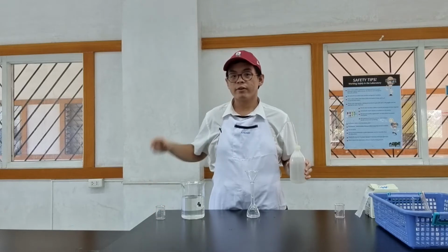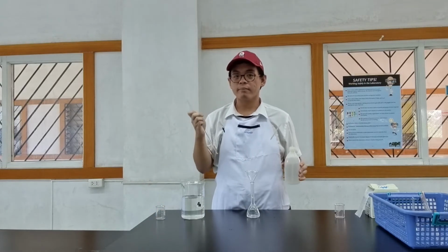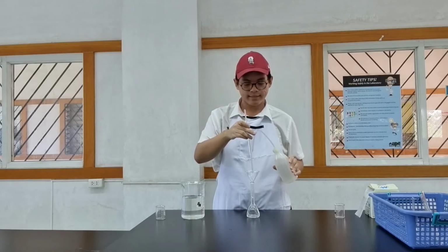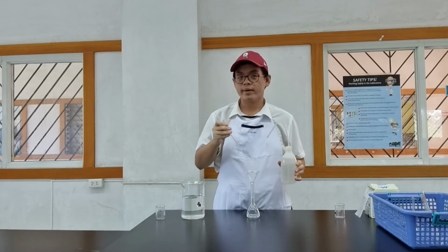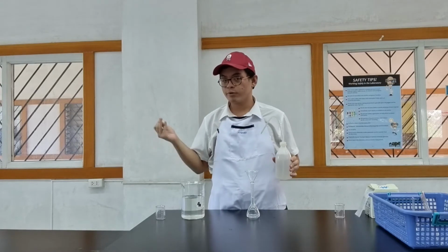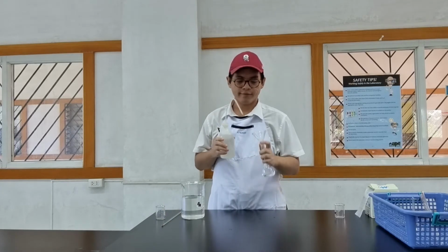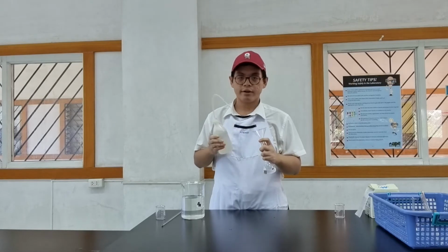If you noticed, however, I never put down the glass rod because I also need to rinse it 3 times. First pass, second pass, third pass. I'm now done with my stirring rod, so I could put it down. There's no more glucose on the rod. Lastly, I need to rinse the funnel itself. First pass, second pass, third pass.